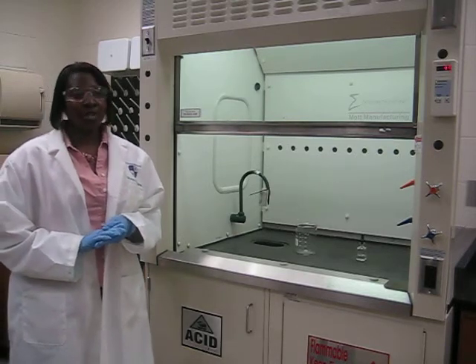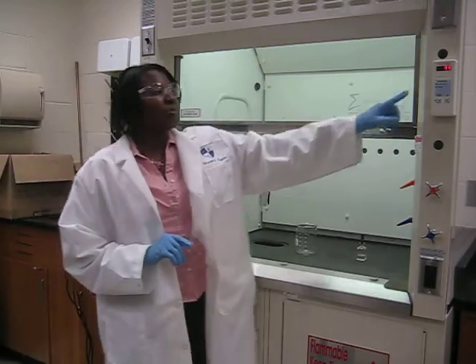Before using your fume hood, make sure that you check your flow rate. It should read between 80 and 120 feet per minute.